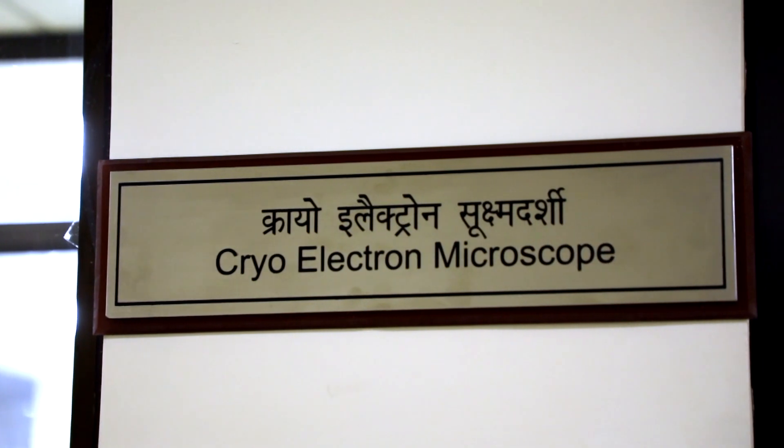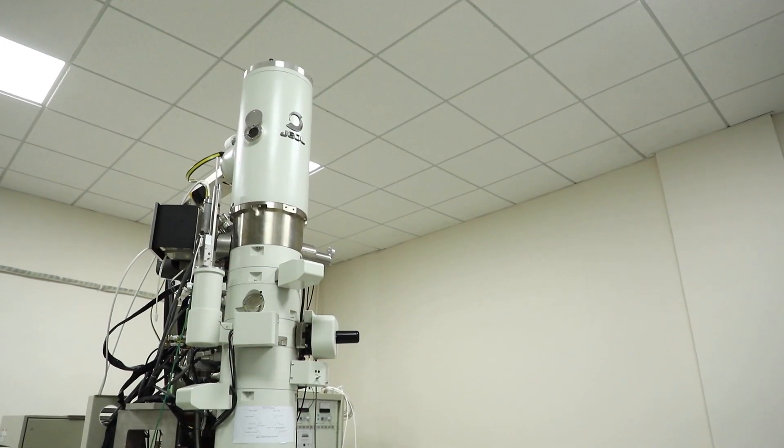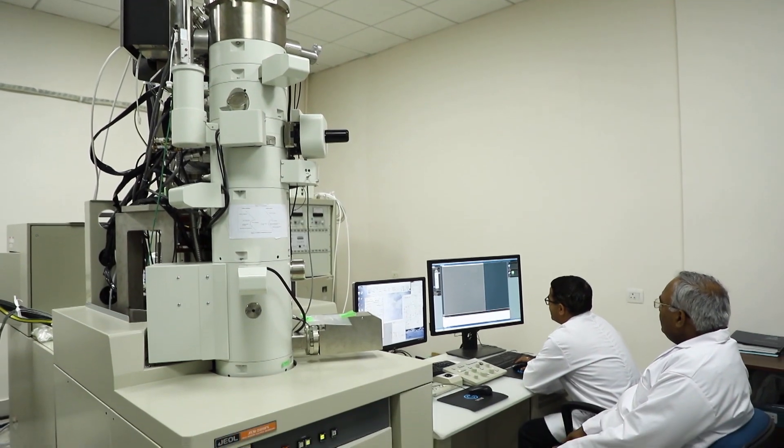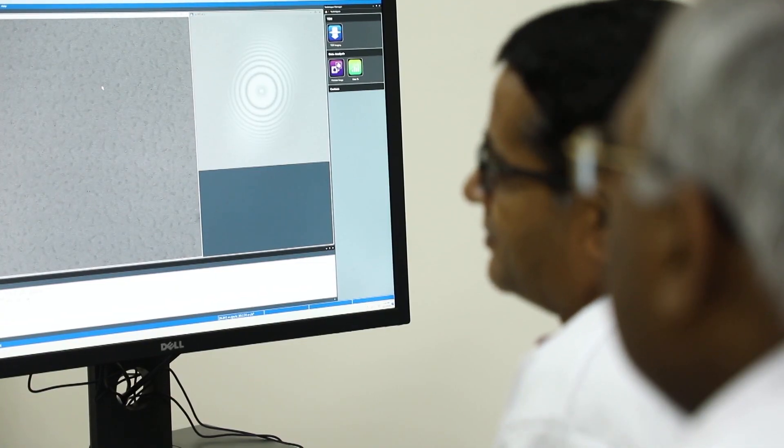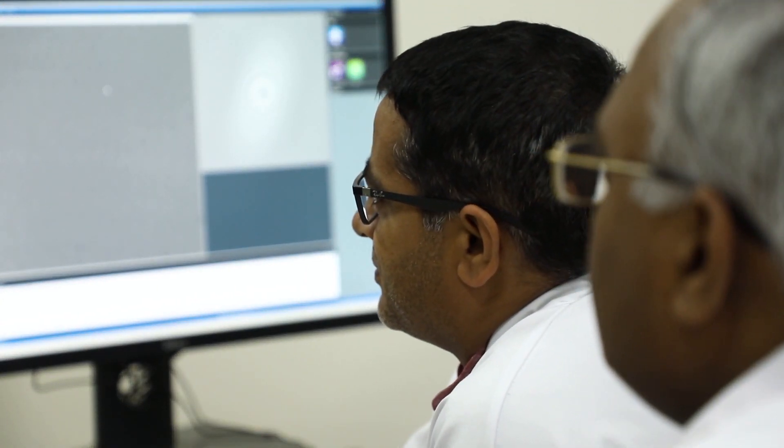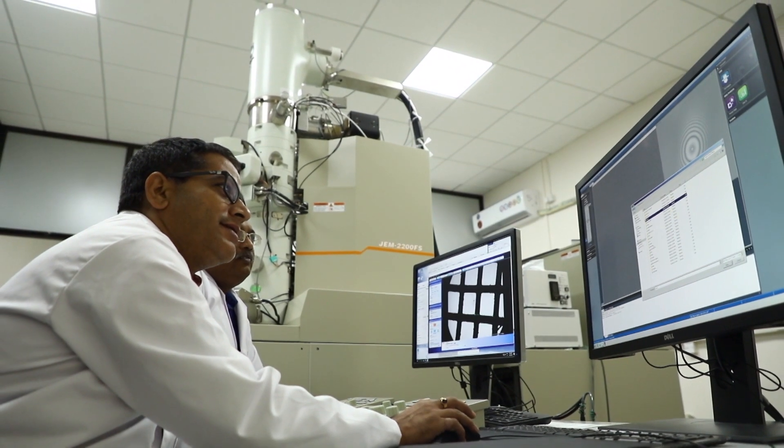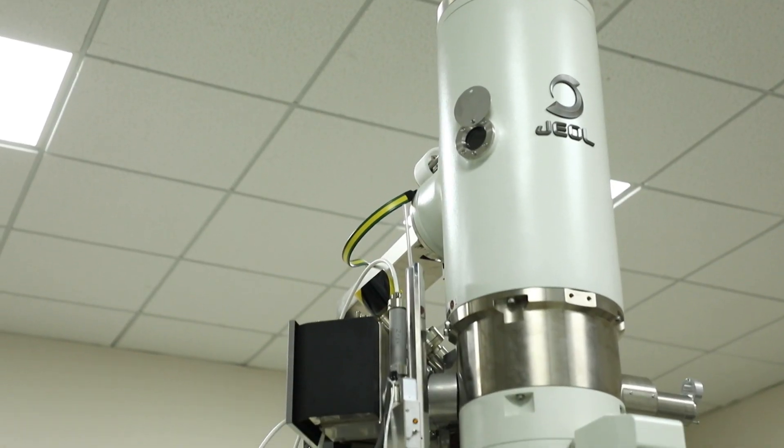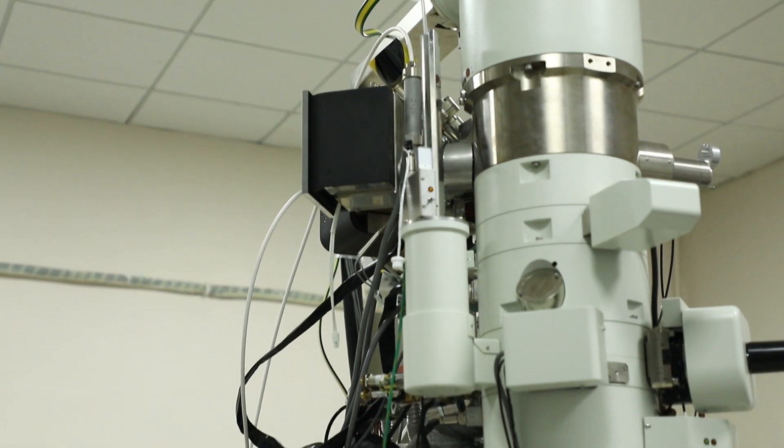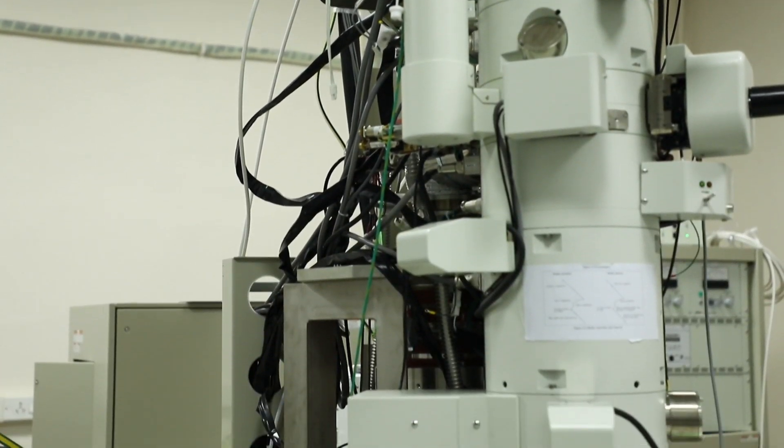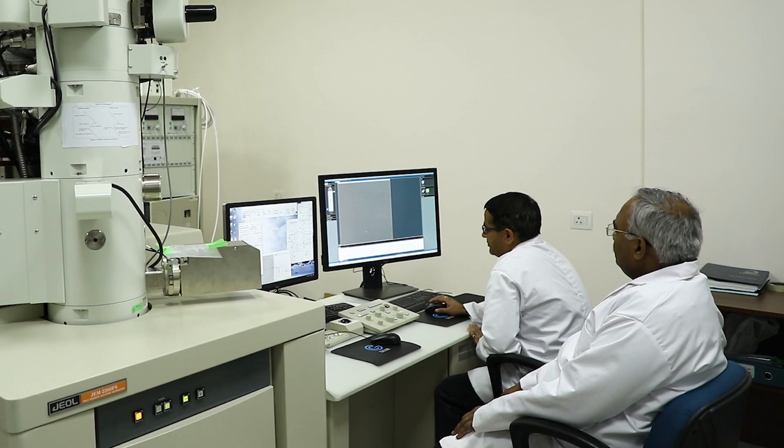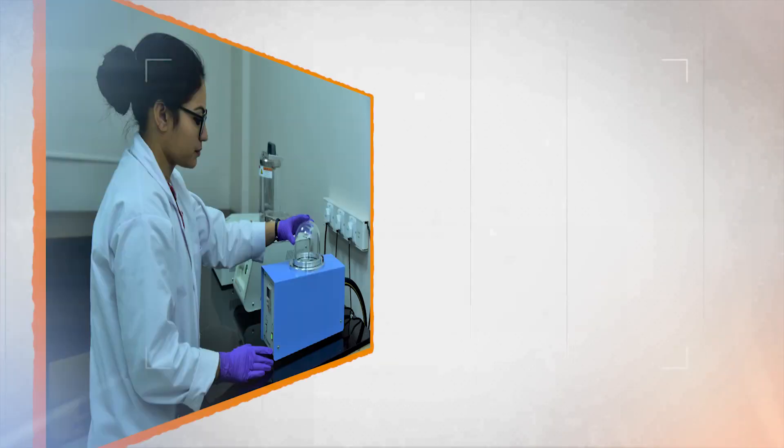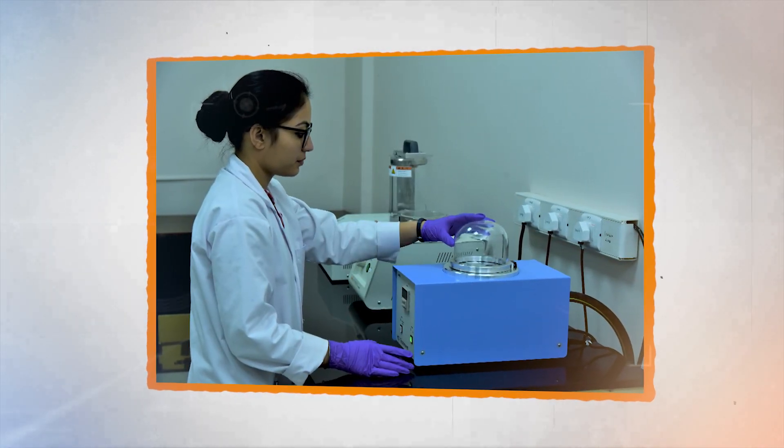Last but not the least is Cryo-Electron Microscopy. Recent path-breaking advances have allowed the use of Cryo-Electron Microscopy to obtain the structure of macromolecules. In Cryo-Electron Microscopy, samples are imaged in its native condition at cryogenic temperature. Due to recent developments in detector technology and image processing algorithm.